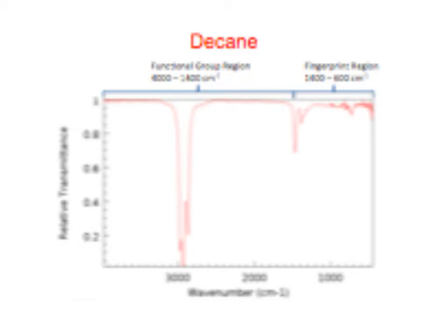So I usually think of the spectrum of just some alkane as being often the background, right? Because at least if our molecule has very much aliphatic, saturated portion, it's going to have these peaks, and then other functional groups are going to be added on top of this, right?